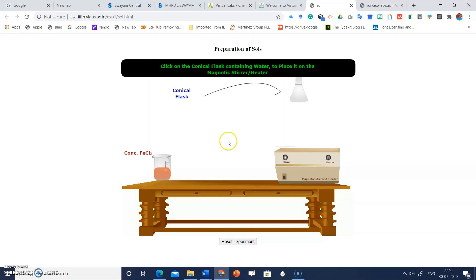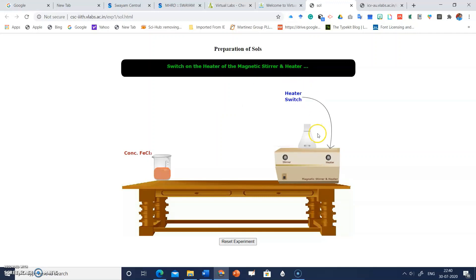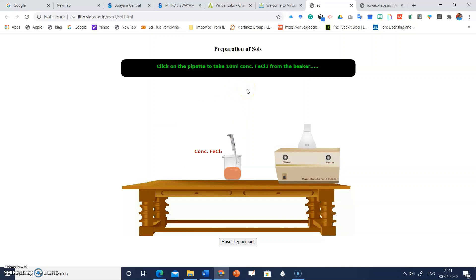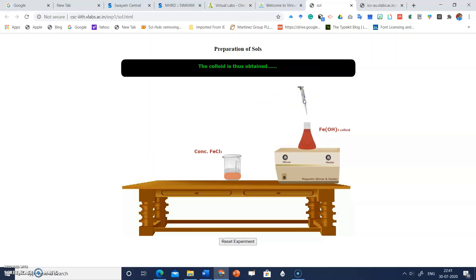Just follow the instructions written on screen. Click on the conical flask containing water, then click on the magnetic bead, then switch on the heater and the stirrer. Wait till the water boils, then switch off the heater and click on the pipette again. The colloid is thus obtained. Students can really enjoy doing these virtual experiments. Explore more experiments on this virtual labs platform — a great initiative by MHRD. Thank you.